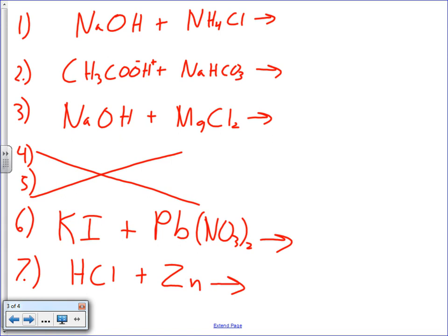So on those ones, getting the correct reaction is going to be a little bit tricky. You're going to have to think about those a little bit more than the others. The others are mechanical, the double replacement or single replacement or whatever, and they work exactly like they're supposed to. These two did not. So here are the little hints I'm going to give you. In this reaction, the gas that was produced is that. There are 3 products in that reaction.